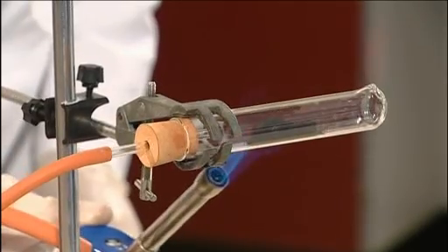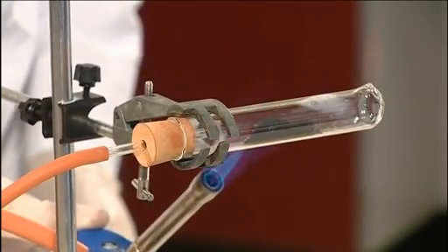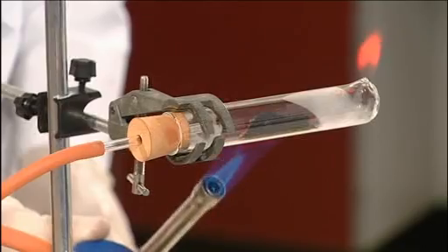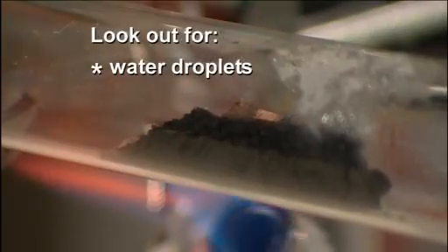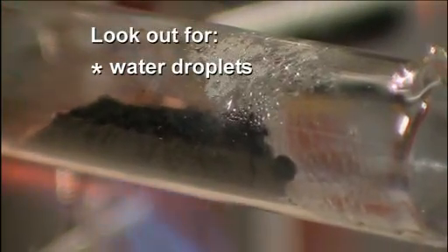At this point, a number of interesting observations can be made, and these will probably need to be pointed out to the audience. Droplets of water will condense on the cooler part of the reduction tube near the hole. These will evaporate as the tube gets hotter.